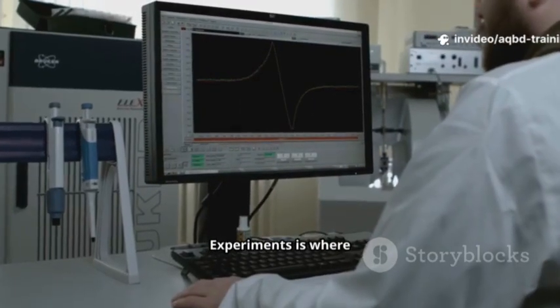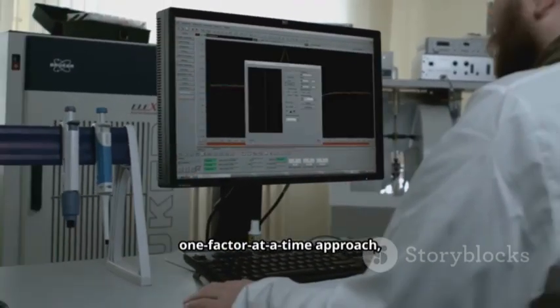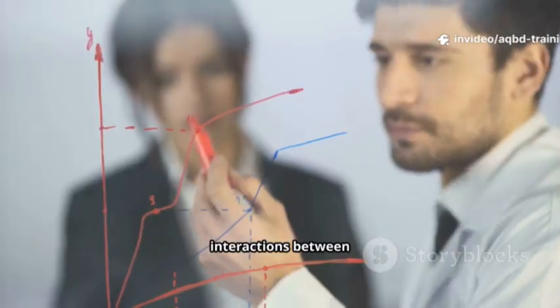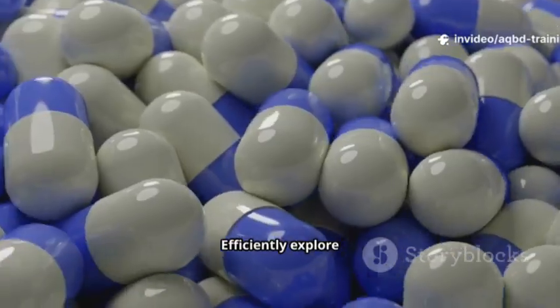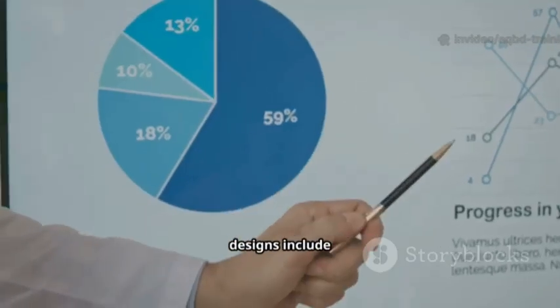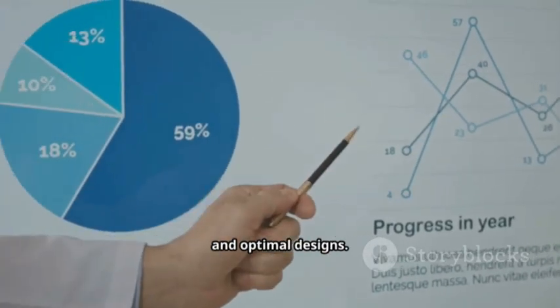Design of experiments is where AQbD really shows its power. Instead of the traditional one factor at a time approach, DOE allows us to study multiple factors simultaneously, identify interactions between variables, efficiently explore the design space, and build predictive models. Common DOE designs include factorial designs, response surface methodology, and optimal designs.